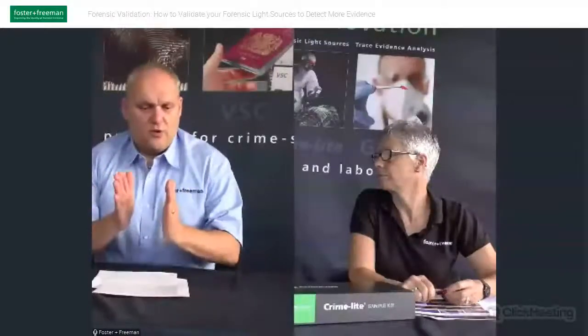But the problem is, if you want the best light sources with the most power and it'll give you the best results, they do cost more money. It's as simple as that. And you know, we do see a lot of light sources on the market where the performance is really, really poor, and people are just not going to find much evidence. You know, you need the power. You need the correct wavelengths over a narrow band of illumination.